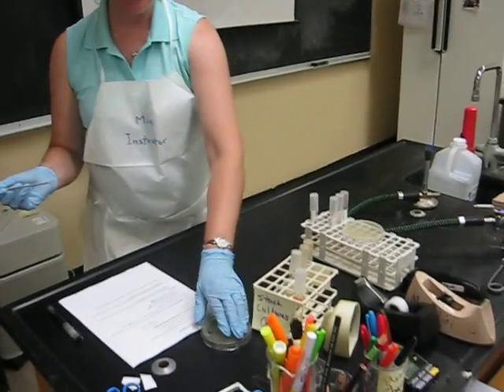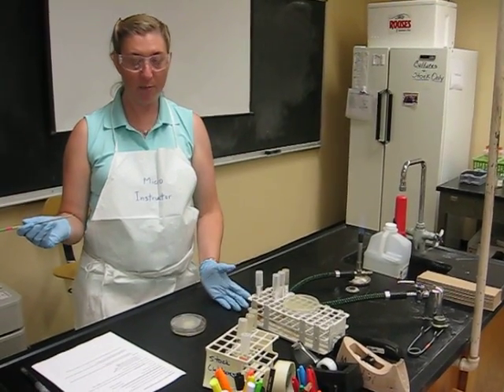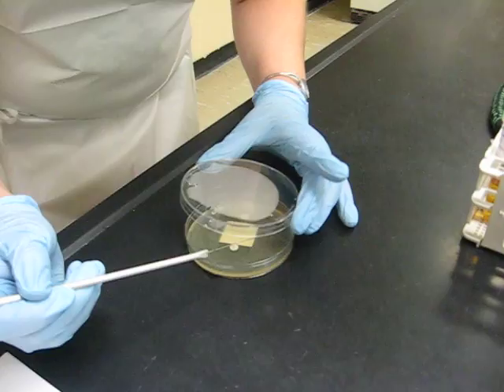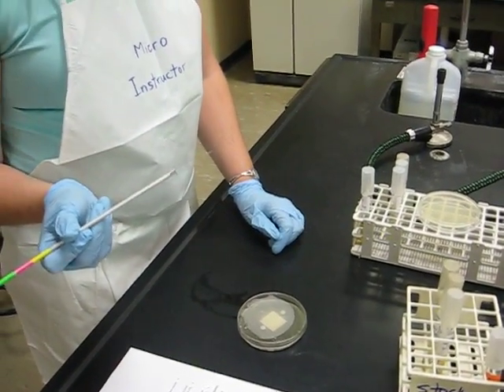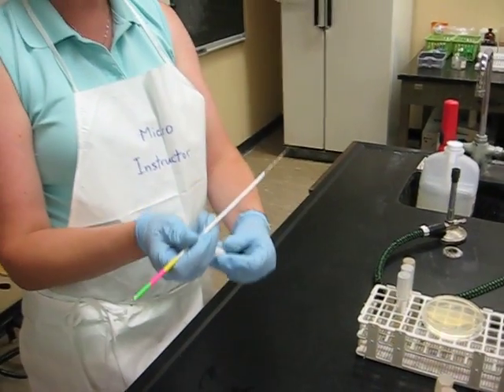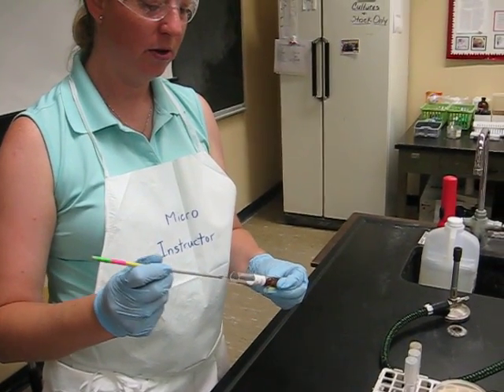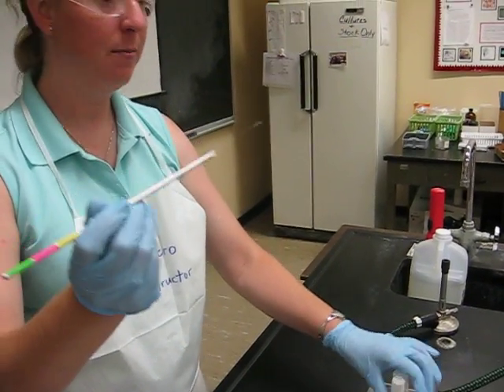Last one — a plate. This is a conundrum: I can't flame this because it's plastic and it will melt. So how do I prevent airborne contamination? I pick up the lid — you can see through the lid — and I just pick up a little bit of bacteria. You can barely see where I took from, and you can barely see it on my loop. Put that aside, go to my broth culture, grab the cap, flame, knock the bacteria off, come back out, flame, cap. Flame my loop, and done.